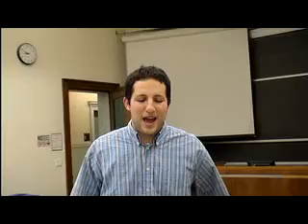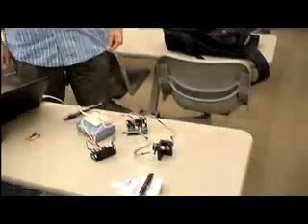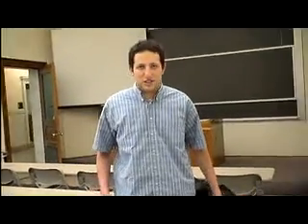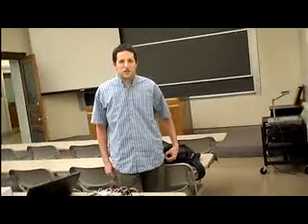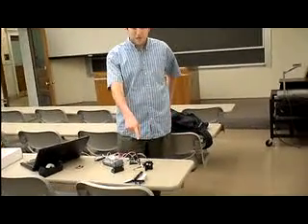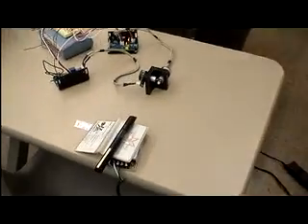We're creating a photo transfection system, and we want to give a short demonstration of our prototype. For our final project, we're going to have a system to steer a laser beam onto a specific spot on a microscope slide. But for our video deliverable, we created this prototype, which shines a laser beam from a laser pointer onto a specific spot on a grid on the wall that we've just printed out and taped onto the wall. So I'll just go over the parts of this system.